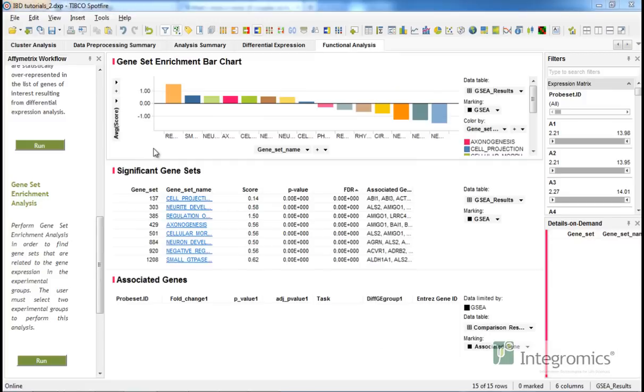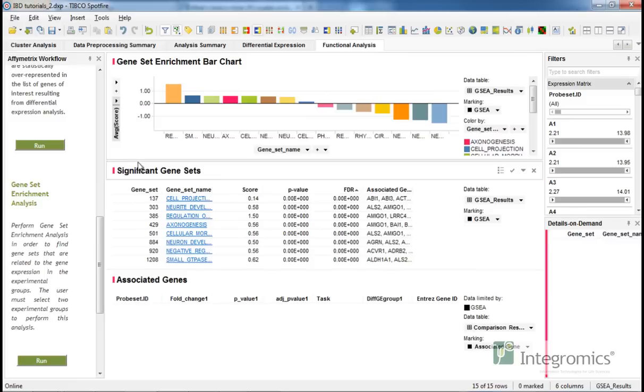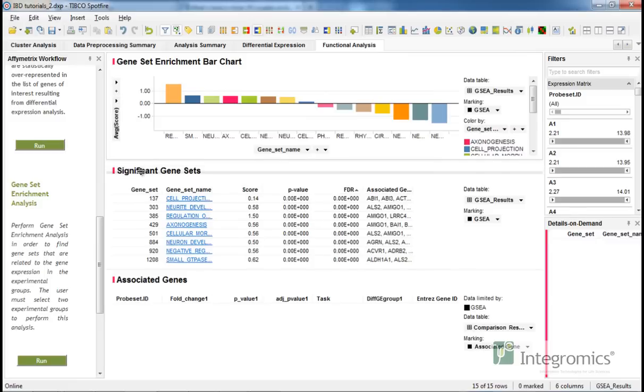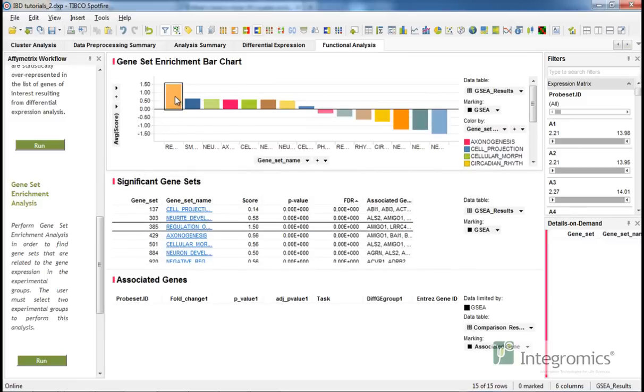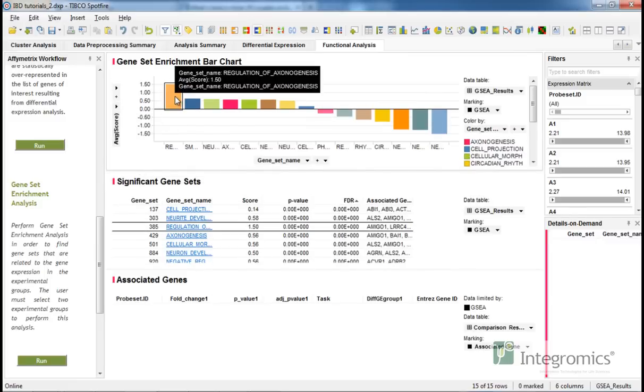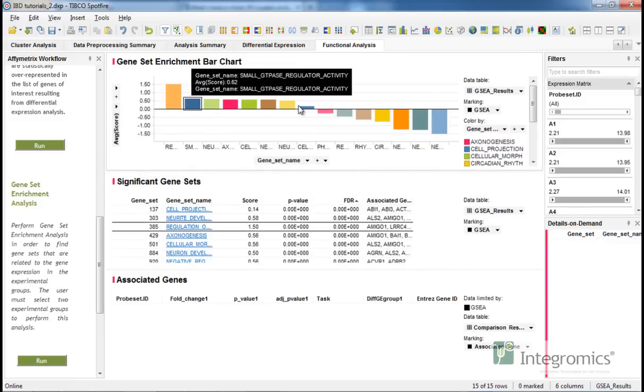Just like the GO enrichment analysis, we can visualize our data using an interactive combination of graphs and data tables. Geneset enrichment determines a geneset score for each geneset represented in this enrichment bar chart.